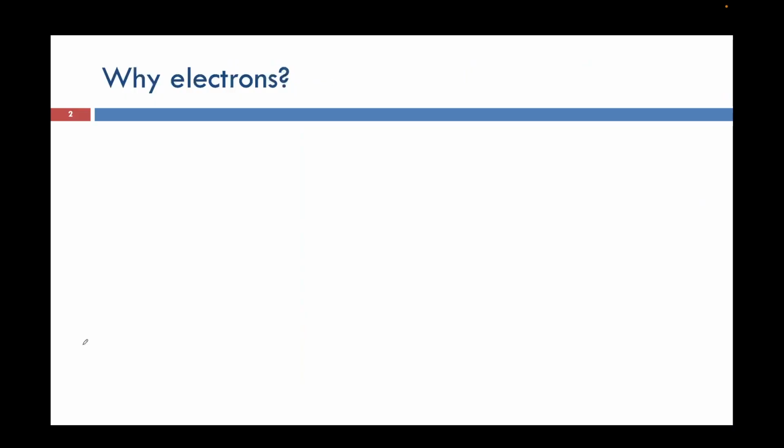Okay. So today we are going to study a new type of characterization technique that many people use across the world. We have completed optical microscopy, scanning electron microscopy, as well as the X-ray diffraction technique.